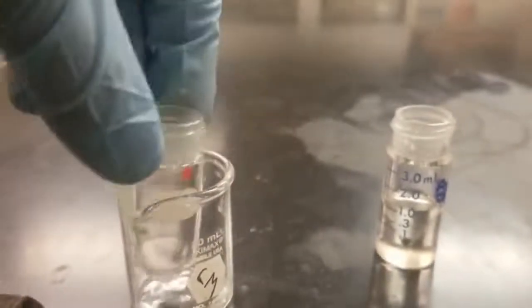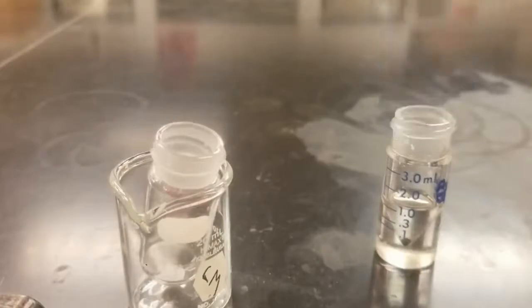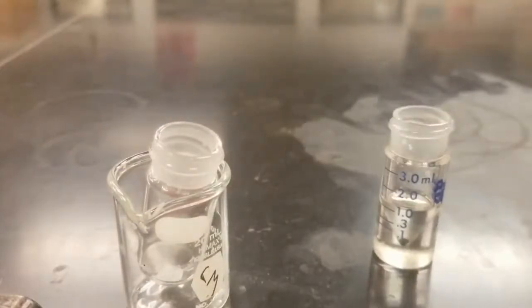Cool. And we've got it all, so now we can go ahead and try to evaporate off our methylene chloride.